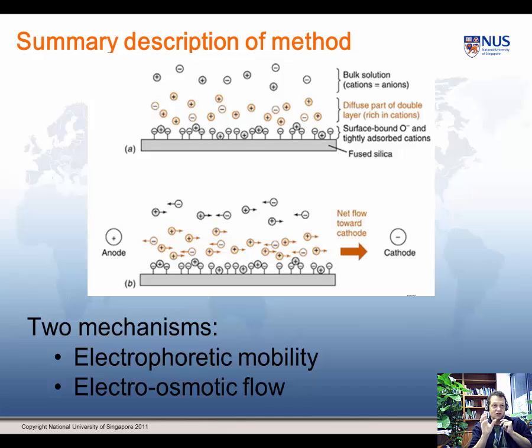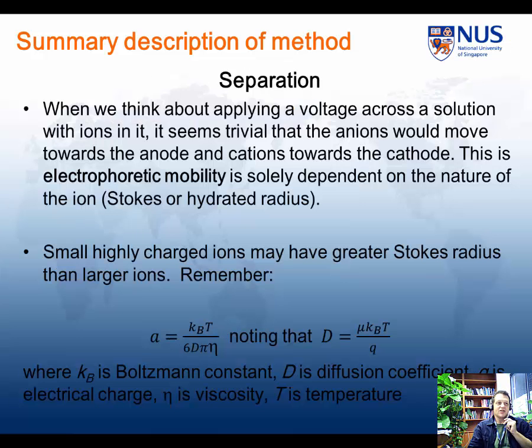But this is a driven cell, and there are two mechanisms for the mobility of the ions, and we'll think about those in a moment. So we'll think of the first one, electrophoretic mobility.